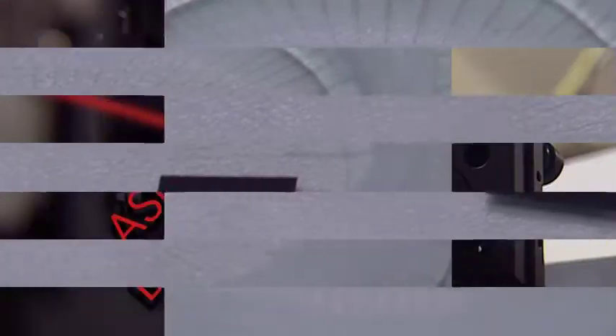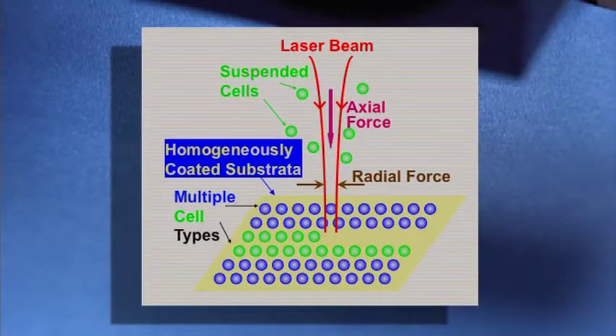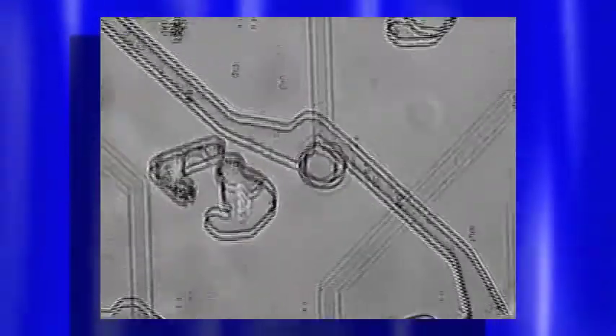It looks like glass. We use a laser to place different types of cells accurately on this chip. Our laser tweezers system is used to move cells from a cell suspension and place them specifically onto this chip.